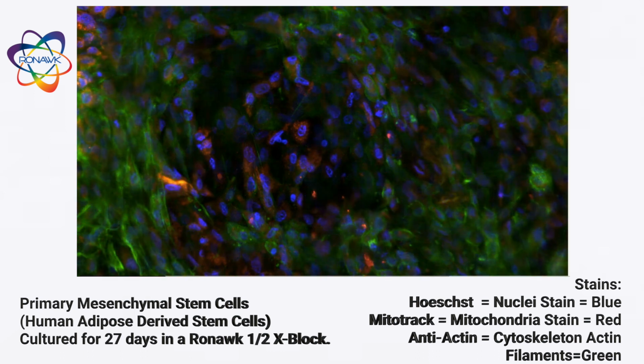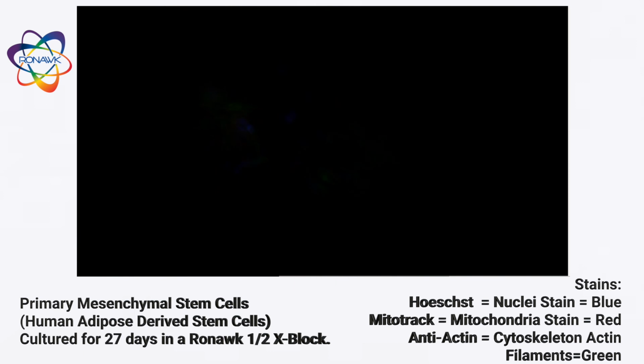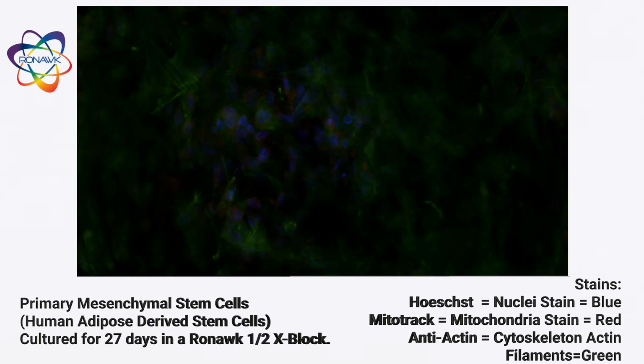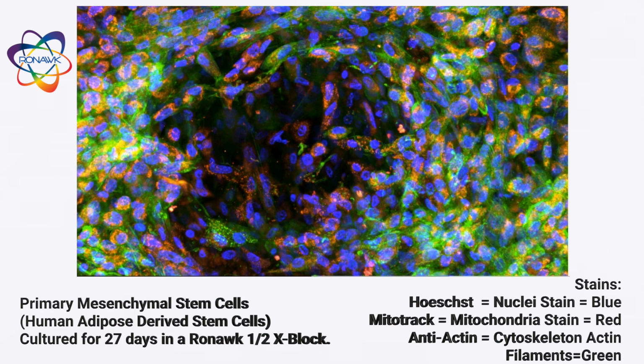When compared to images captured on the top of the block, the cell behavior and organization is different, showing adaptation and that they are taking advantage of the topology of the growth surface.